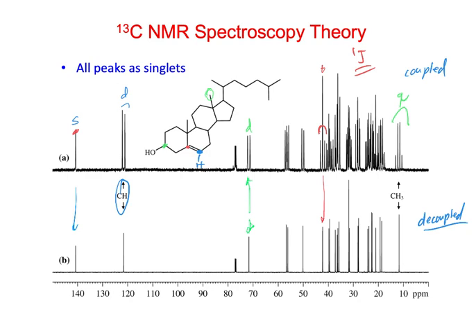Oh, that magnetic non-equivalence. There we go. I don't know if we could set up a situation like that with just one bond coupling. Okay. Yeah. You know, and there may be longer range couplings that are in here, but they're much, much, much smaller than this, so we don't really see that.